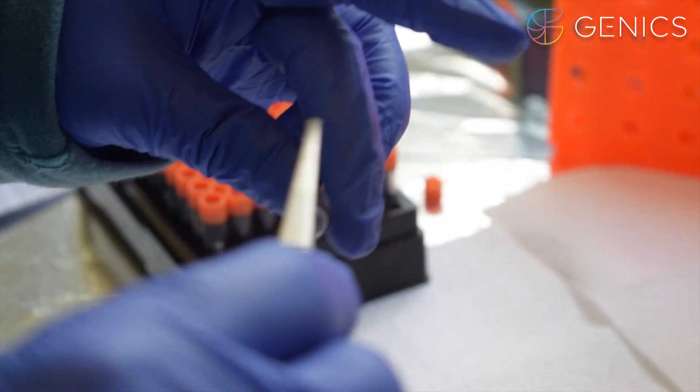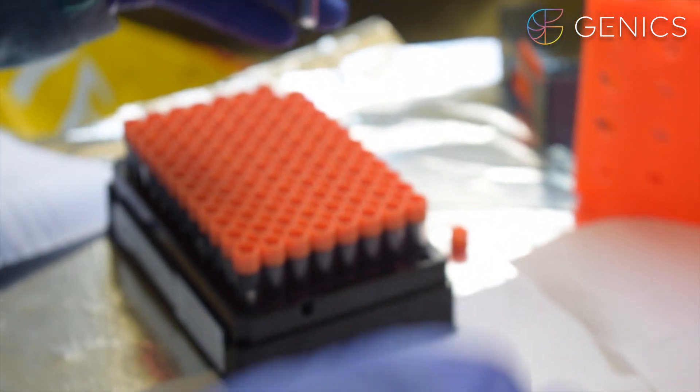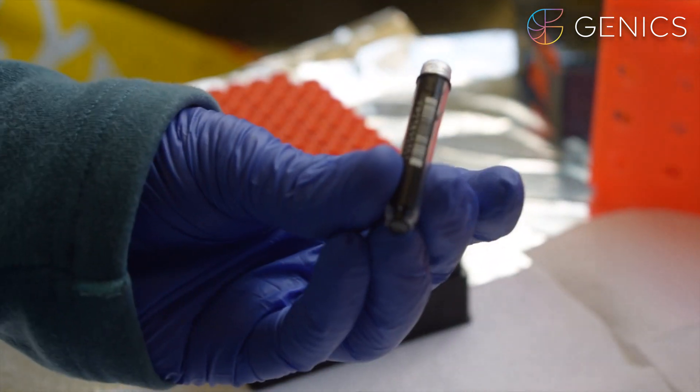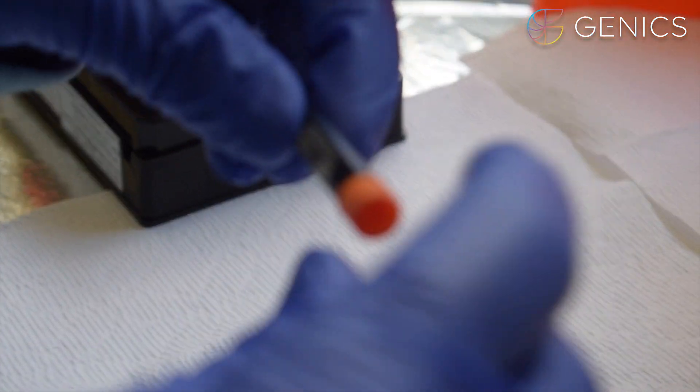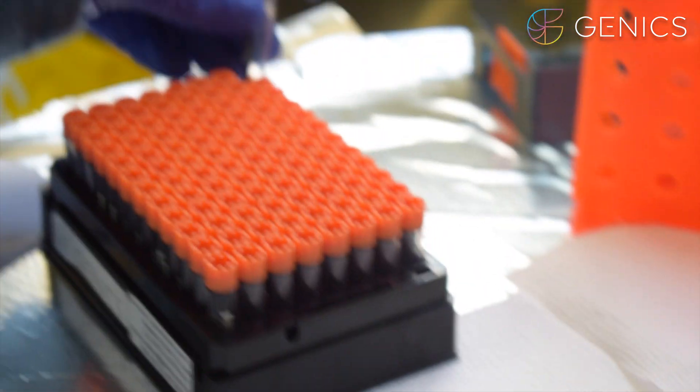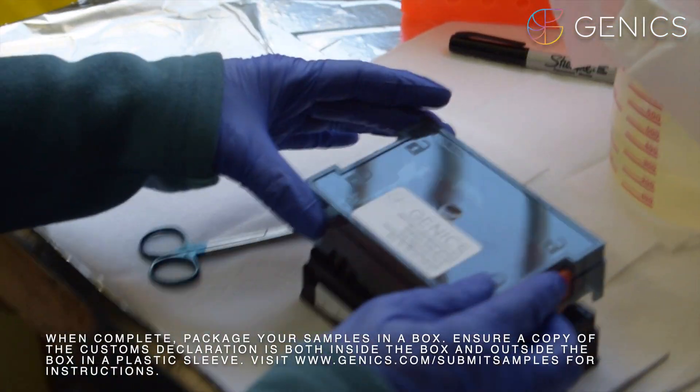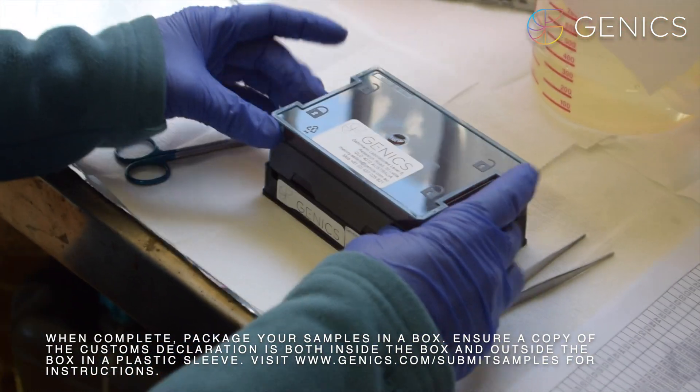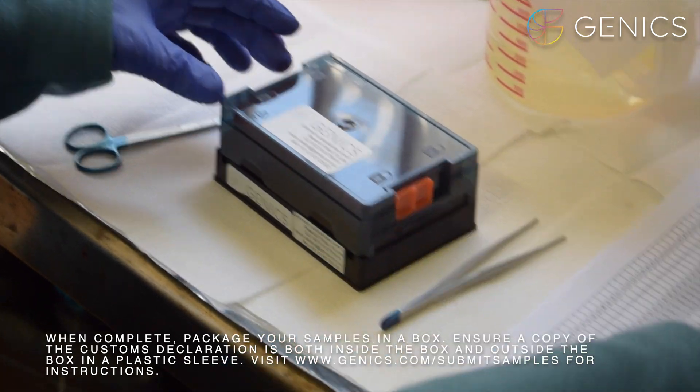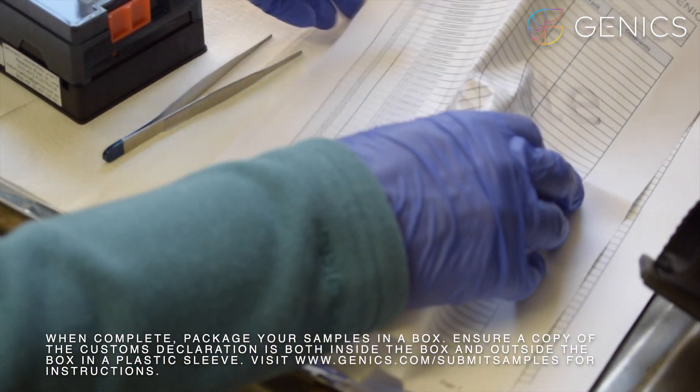So into our tube once we have our 15 heads we screw the orange lid back onto the tube and then return the lid to the box and click it into the locked position. You then pack this up with your data sheet ready to send to the Genix services laboratories.